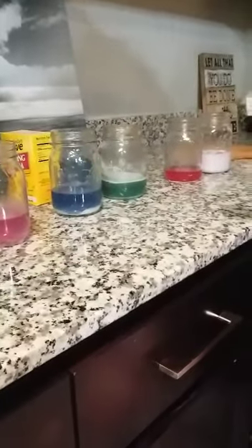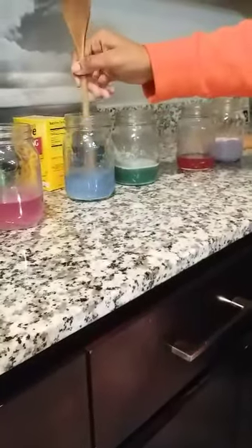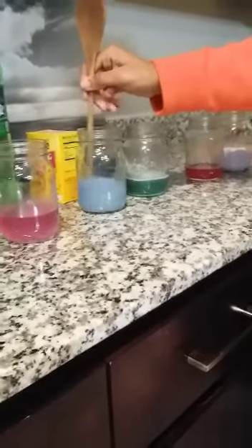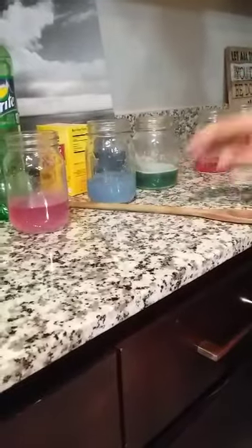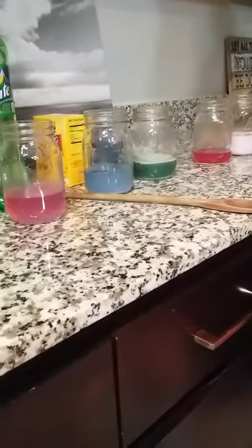So let me mix it up since it kind of settled out at the bottom. And that's the baking soda mixture. So it turned really, really basic. Very, very basic after that.